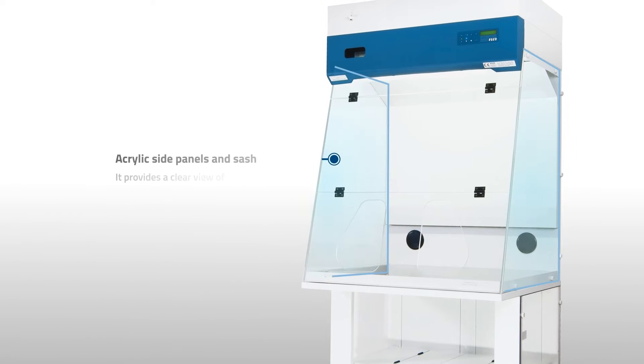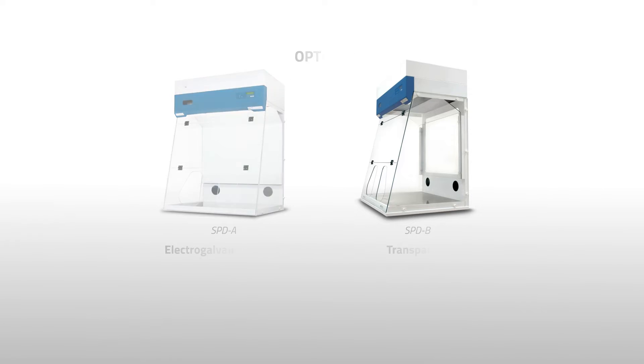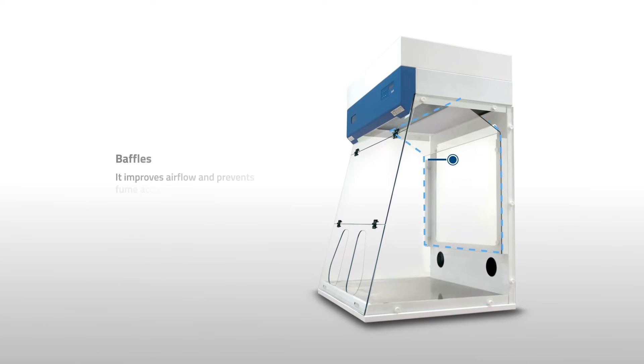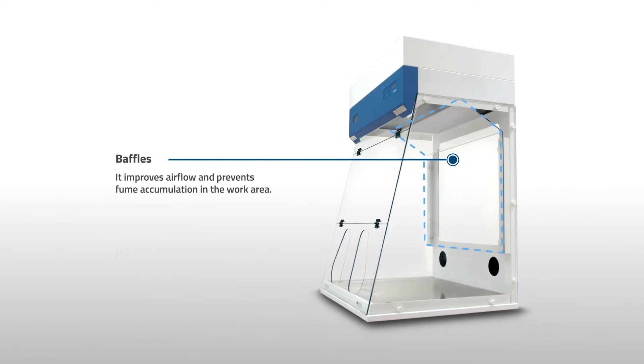Acrylic side panels and sash provide a clear view of the work area. Options of electro-galvanized steel or transparent back walls are available. Baffles improve airflow and prevent fume accumulation in the work area.